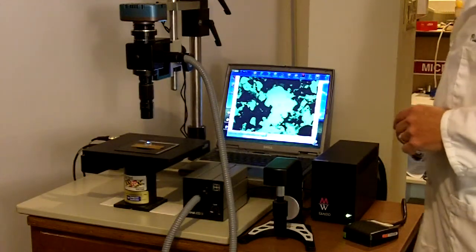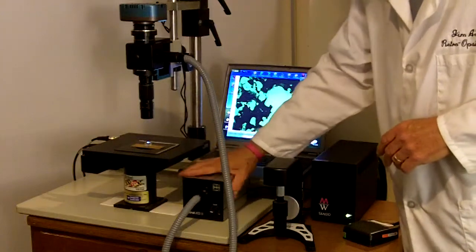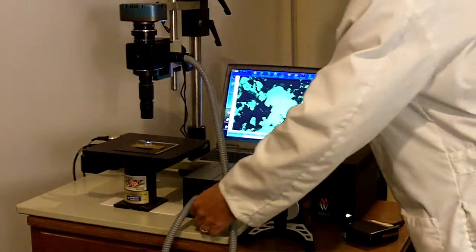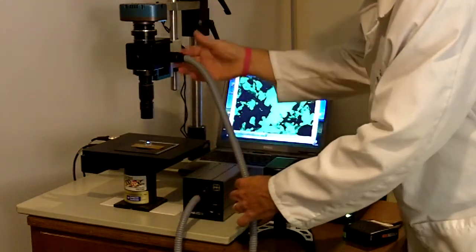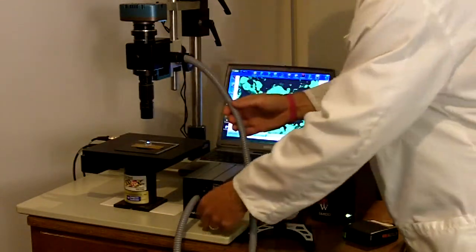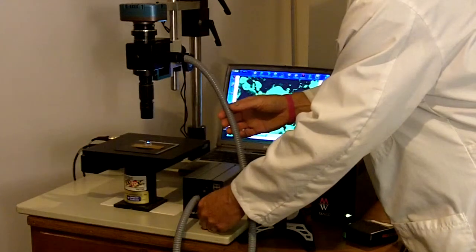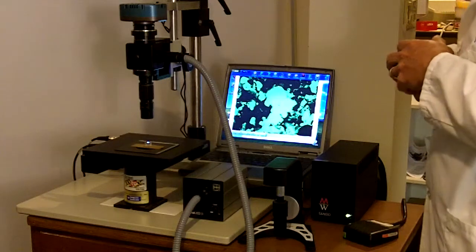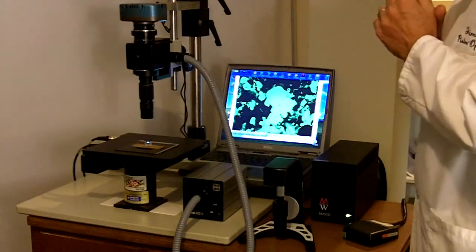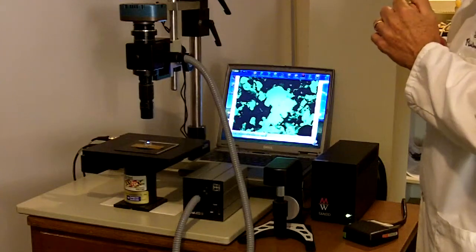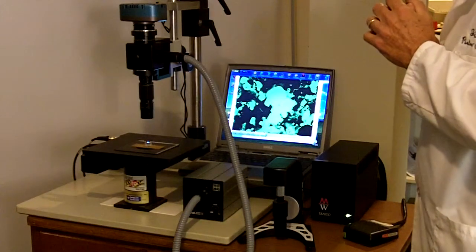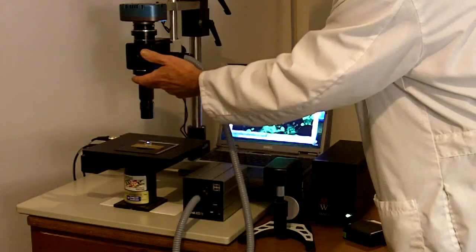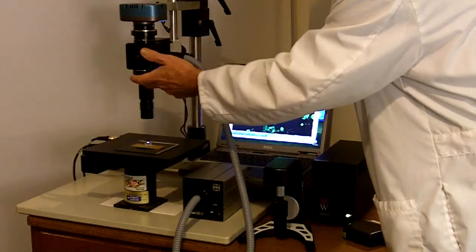Another very nice enhancement is the latest state-of-the-art LED illumination system from Volpi. This unit attaches to a glass fiber optic guide and this allows us to attach a whole selection of fiber optic guides, liquid light guides, whatever the experiment can call for. The aperture diaphragm that's built into the unit can be used to adjust contrast.